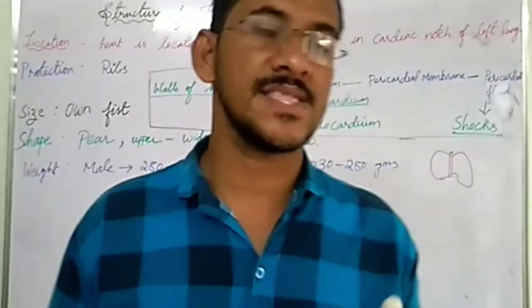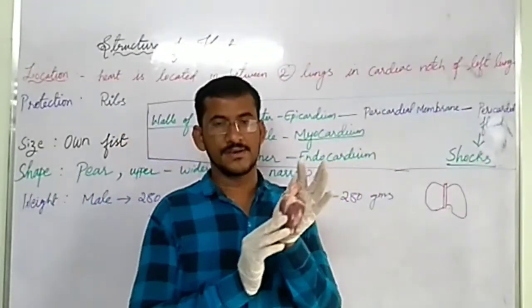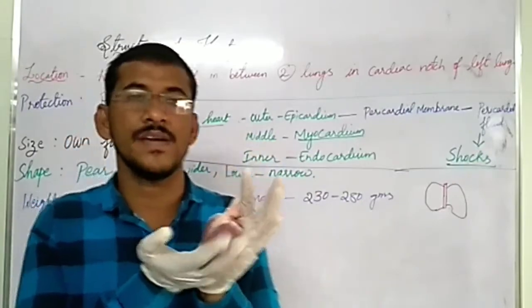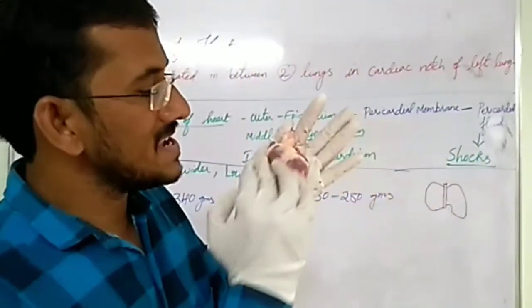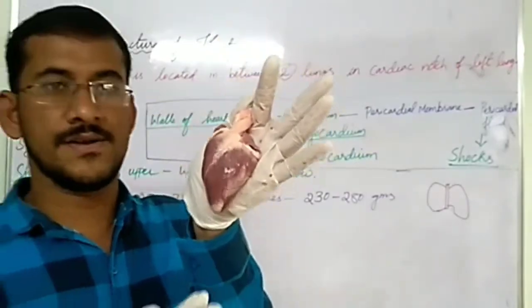Now let us see the lab activity, the internal structure of the heart. So I am going to dissect this heart and I am going to explain to you the inside structures, inside parts of the heart.